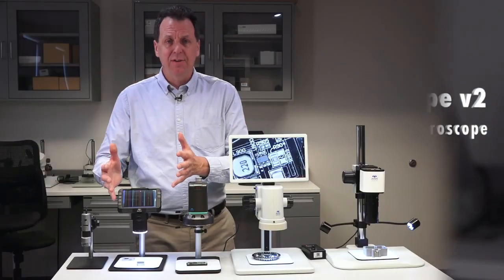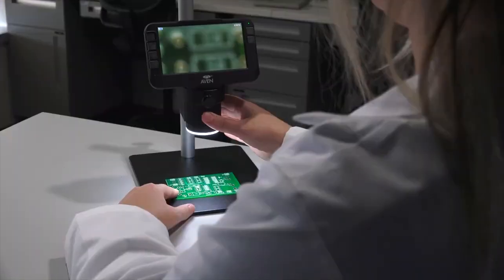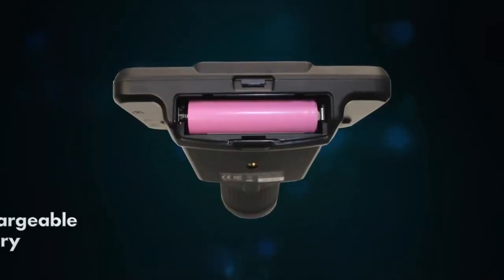Next up, we would have the Aven Clearview. The Aven Clearview is a digital microscope with a built-in light and a built-in screen. Magnification levels are 8 to 25x, and it is either plugged into the wall or detachable and operated on a rechargeable battery.